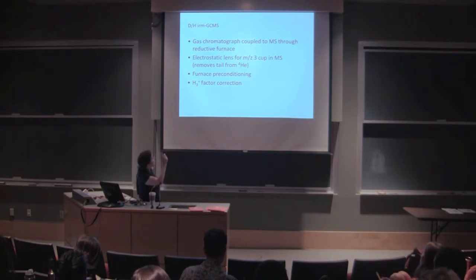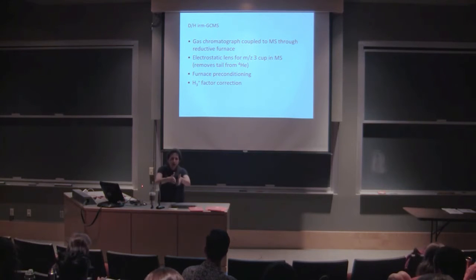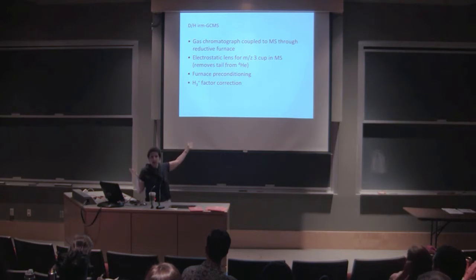In summary, it is the chromatographic separation. But there's a little more complexity to it. The trouble is that you've got, you're looking for three, mass of three, in a flow of four. And so you've got a lot of helium flowing into your mass spectrometer. And the ion beam is not perfectly focused. There's a little bit of dispersion always. And so some of that dispersed structure to the ion beam of the helium will spill into the cup three. So the way that this finally became a robust technique is when they added a very small electrostatic lens that sort of keeps the mass four from spilling into cup three. And that's one of the secrets that you may not know as a user, but that really has made this possible.